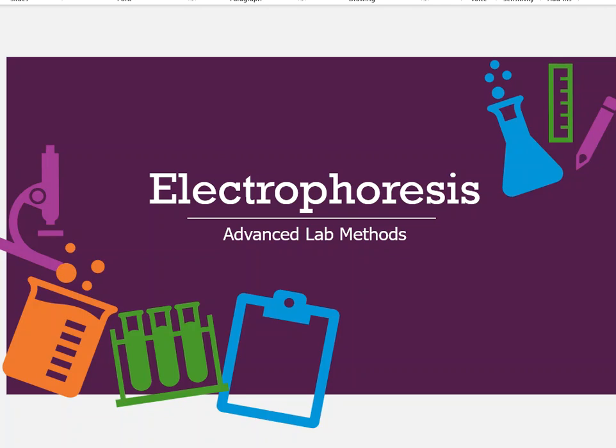Now, I want you to keep in mind that electrophoresis will be used again, and most of the time we use it very often in our forensic chemistry course. So this is one of the reasons that you take the summer course first, because we introduce you to the method and we don't really focus on the sample prep as much. We don't really focus on what goes on before it gets to this point in the summer class. It's only strictly electrophoresis. What do I need to do? How do I need to handle it? And how do I ensure that I get really good results from it?